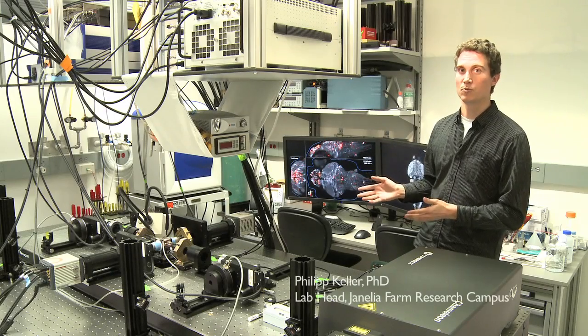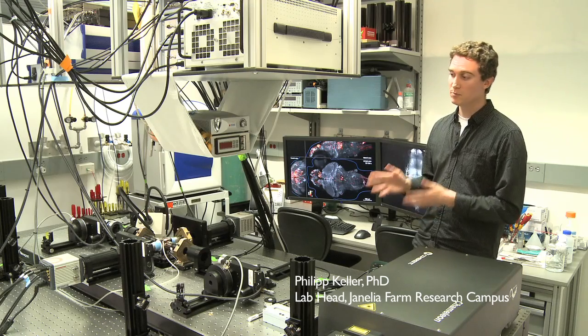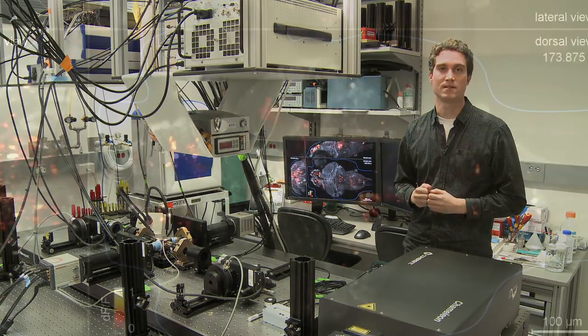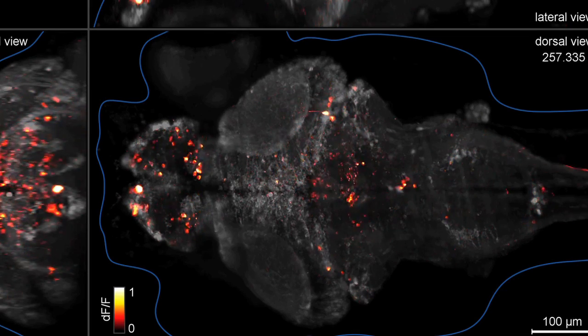We call this microscope the light sheet microscope for simultaneous multi-view imaging, and we developed and built this system to be able to image and follow fast dynamic processes in large biological specimens. In particular, we used it to follow the neuronal activity in an entire brain.